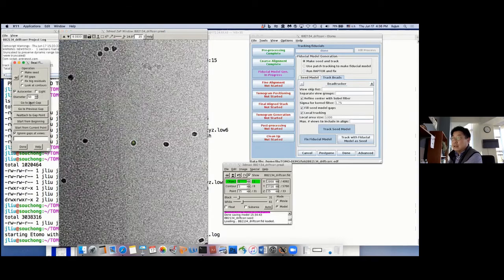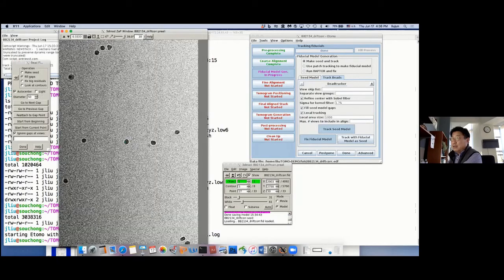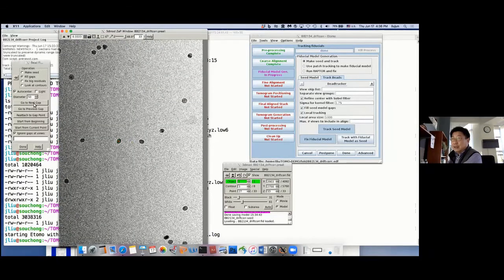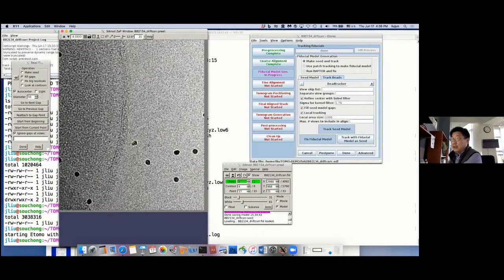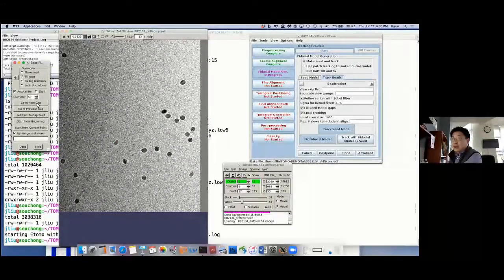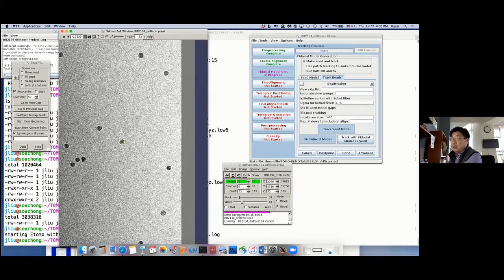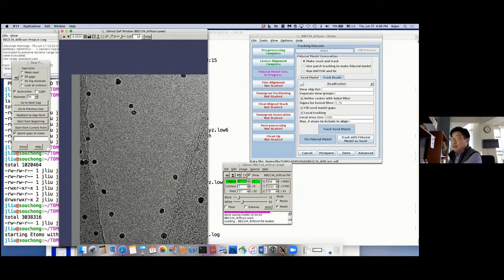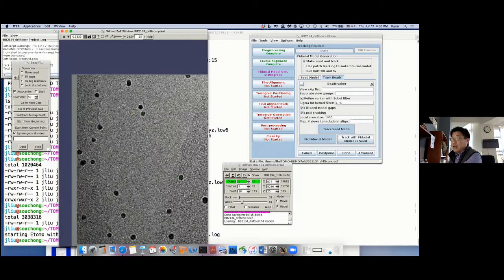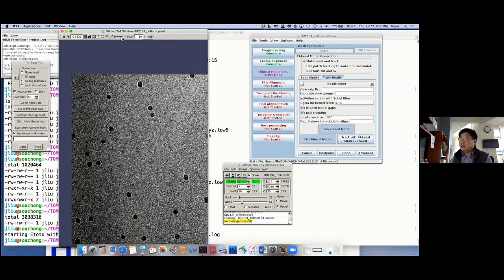then those next. They didn't track all the beads because the computer is not as smart as a human being. So you can see some beads are not tracking properly. Even though automation can fix most of them for you, it's still not as good as the eye. Our eye is actually best. So they said no more gap, so basically all the beads were tracked.